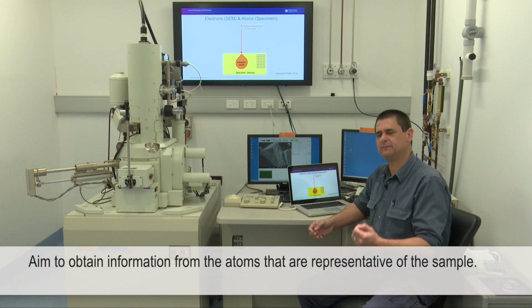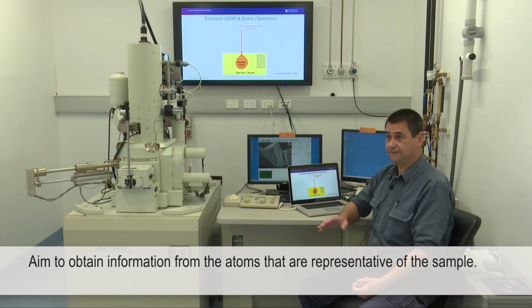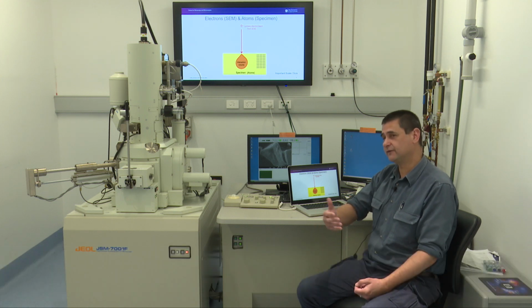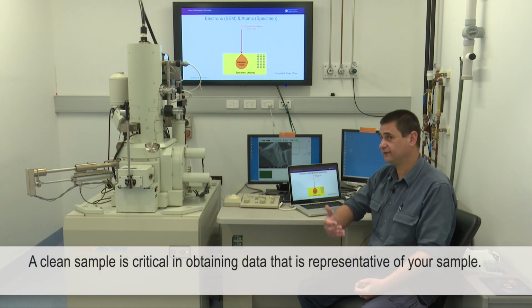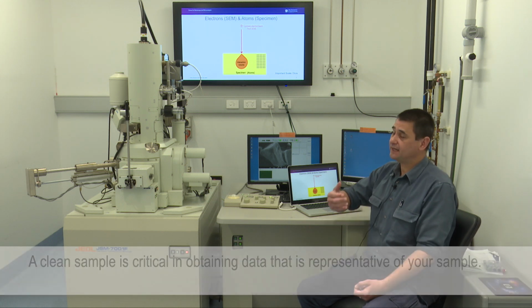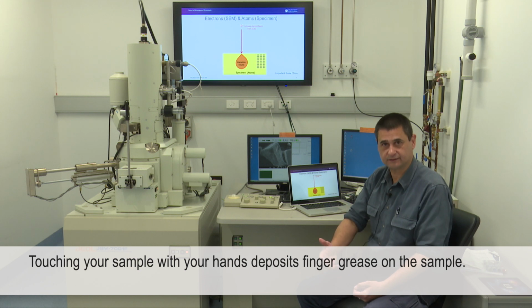You need to get information from the atoms that are representative of your sample. So in particular, if you have contamination on the surface of your sample, that's where a lot of your information will be coming from. So step one in good analysis is give me a clean specimen. If you've touched it with your hands, you have finger grease on it.